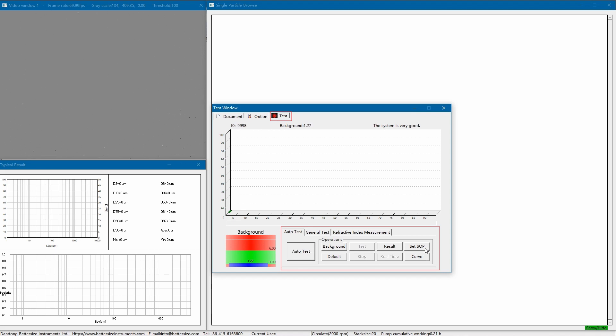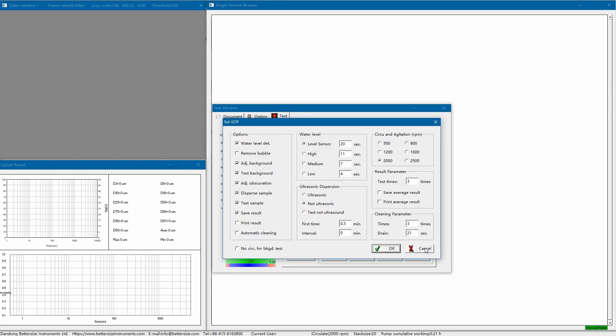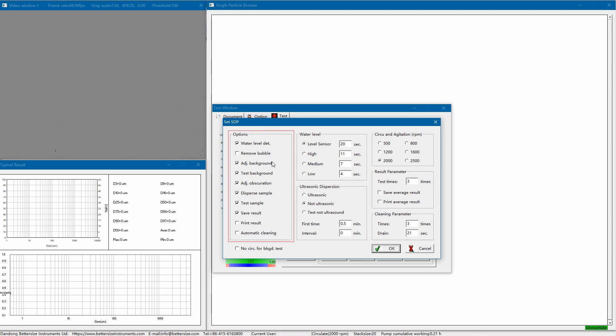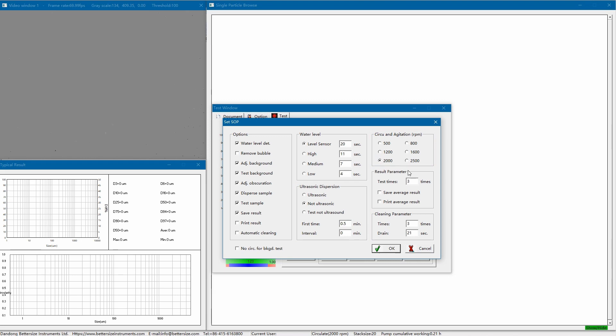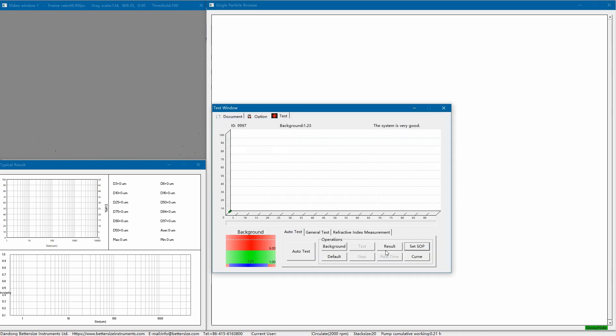First, let's click Set SOP. The reason why the sample can be automatically measured is that SOP has been set up in advance. These operating procedures include water level determination, disperse sample, test sample, save result, and so on. Generally, the SOP settings vary for different samples. The dispersion time is set to 30 seconds for this measurement, and the circulation speed is set to 2000 rpm, and we will measure three times in a row to check the consistency among the results, namely the repeatability. After completing the SOP settings, we click OK to return to the test window.